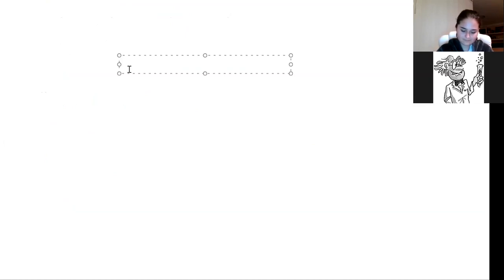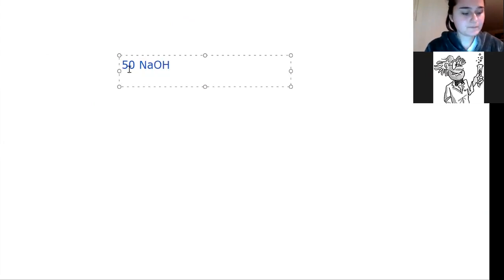So we have our dilute standard NaOH. I will be typing because I still have the answer on my written sheet. So we have our 50 mLs of sodium hydroxide, NaOH, and we also have 50 mLs of 2 molar CH3COOH. Is that literally acetic acid as well? Okay, they're both acetic acid. Hopefully we've got the constant molar for this as well.